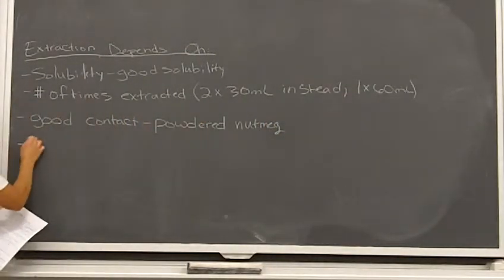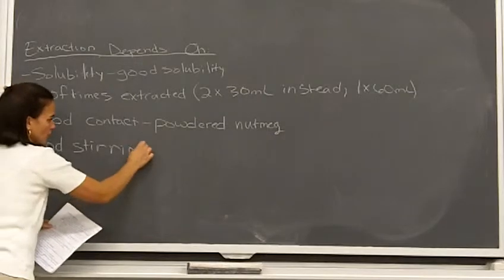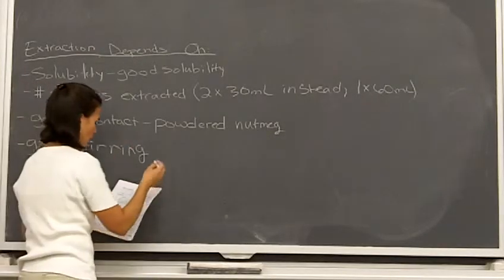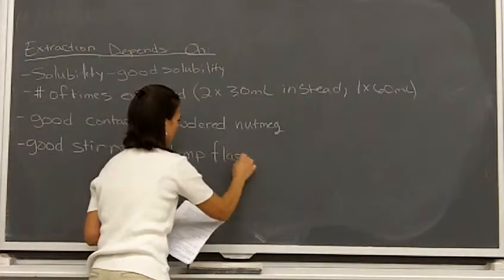The other thing is good stirring. So you want really good stirring, or in the case of the liquid-liquid extraction, we shook the separatory funnel well. And like I was saying, clamp your flask to your ring stand so it doesn't walk off your stir plate.